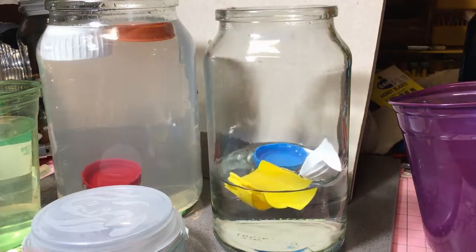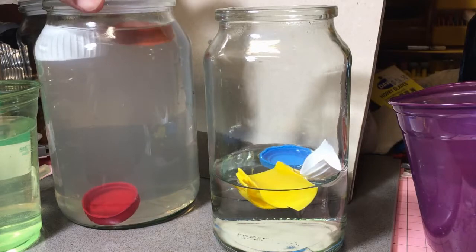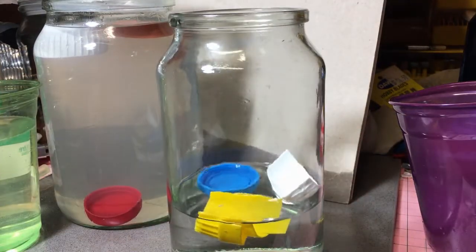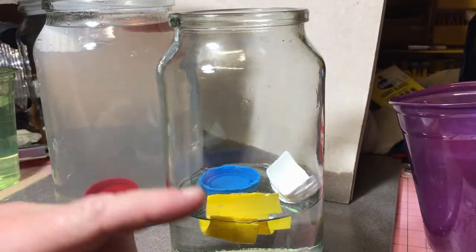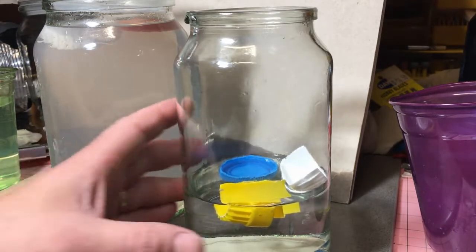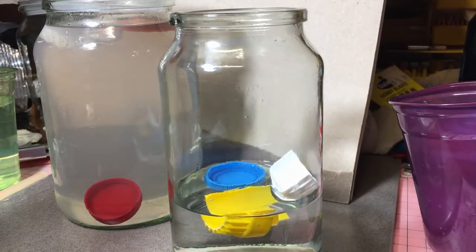Put that in there. What we do now is we do the same as before — we pour in our methylated spirits. As you can see, I have emptied the jar to a degree so we've got more room to put in our ethanol.